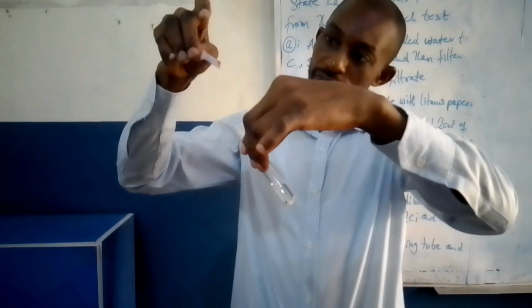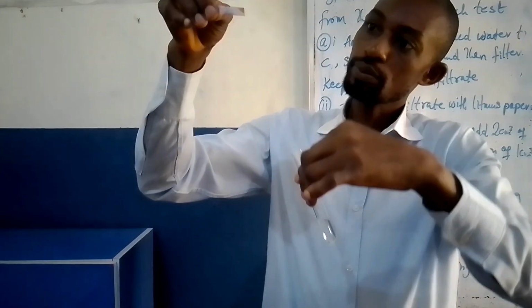No effect on blue litmus paper. So we can record our observation this way.